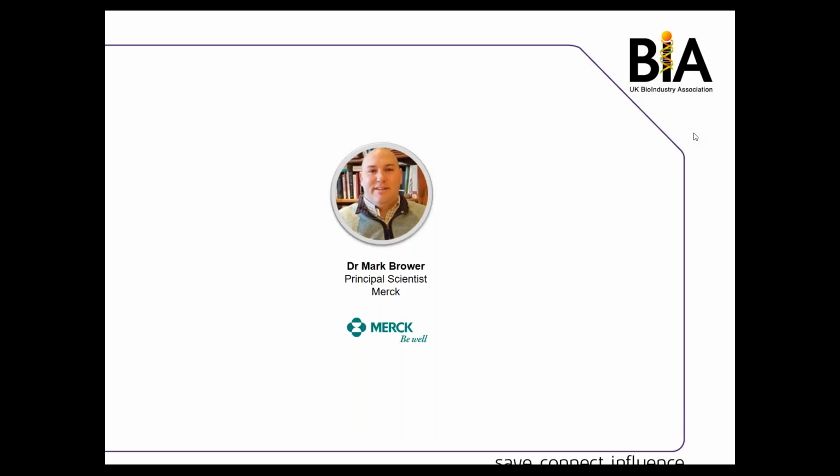Well, thank you very much, Peter, for giving us a great overview of the continuous technologies currently being developed at Merck, at Pall. For the rest of the webinar today, I would like to talk a bit about the scale-up activities that have been going on at Merck with the continuous chromatography system, the BioSMB.